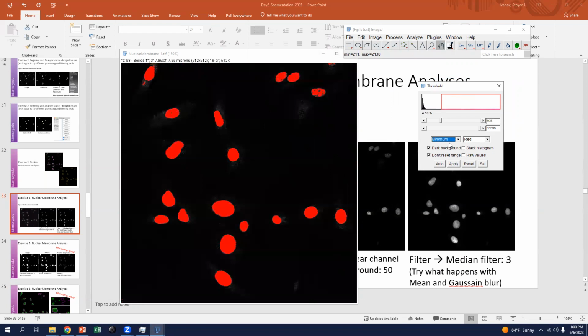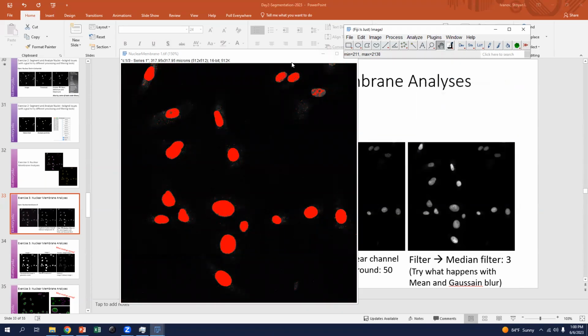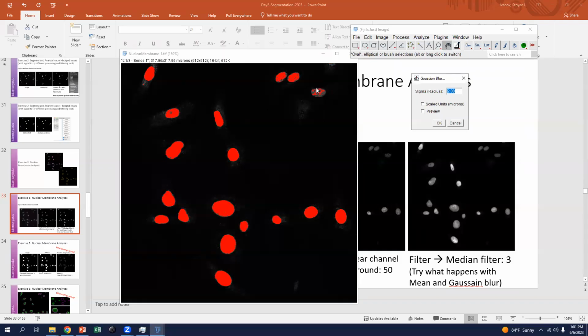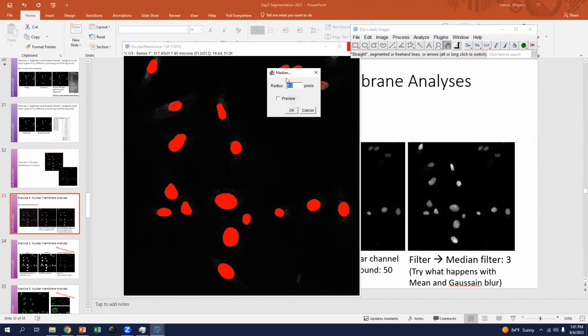So we can skip through them, look to see which one gives a good fit, but there's actually something else we can do as well before we get to the thresholding, and that is we can filter it. So when I mentioned previously the Gaussian filter and the median filter, this is an instance where the Gaussian filter would be good to use. Because while we want to preserve the edge, we also want to kind of wash away the central non-homogeneity of the cells. Because at this point, all we're looking for is to get the outermost perimeter. But instead, actually, there's something else I mentioned. If we were to use the median filter, that would preserve the edge, but also wash away some of the non-homogeneity on the inside. So let's try that instead. Oops.